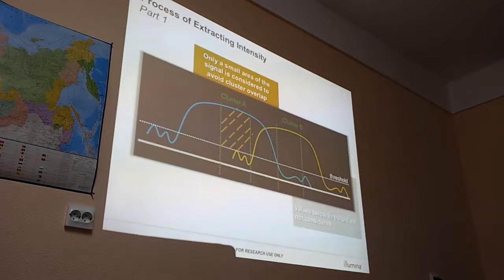So this is why you should try to avoid extreme low complexity. If you have one sample with low complexity, you mix it with other samples with higher complexity, then this can be avoided. You can spike in phiX. You can also spike in another high complexity library, maybe whole genome or exome, or RNA-seq.